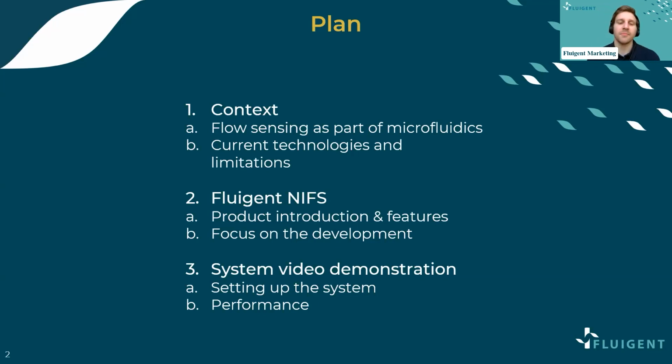And finally, we wanted to show you how the system works in real life. So we made a video including setting up the whole system, the whole hardware as well as the software. We'll also discuss the performance that we can see throughout the presentation.